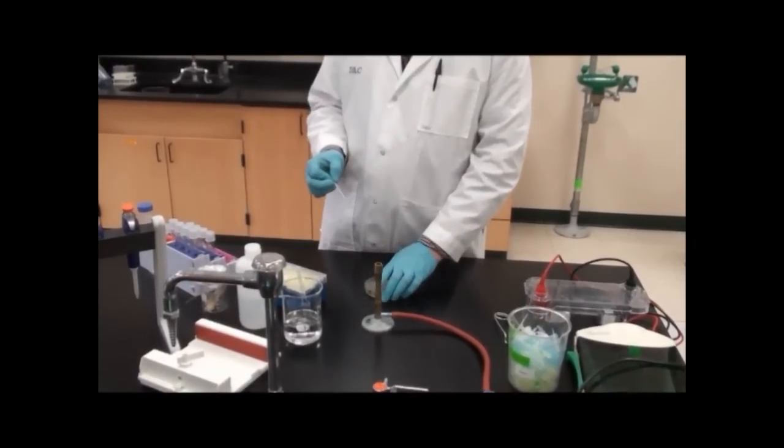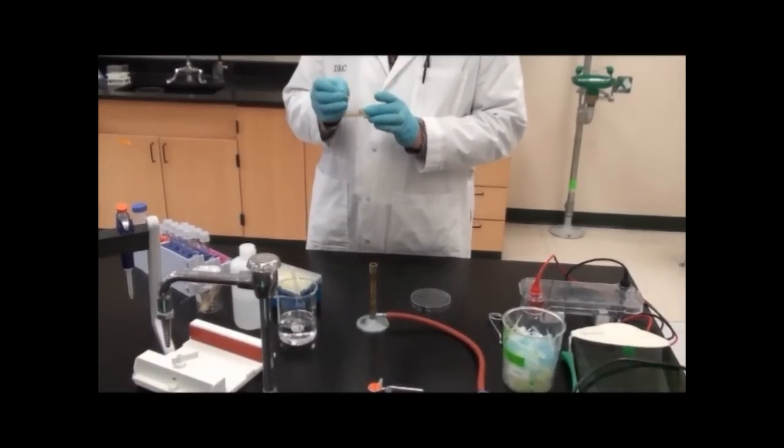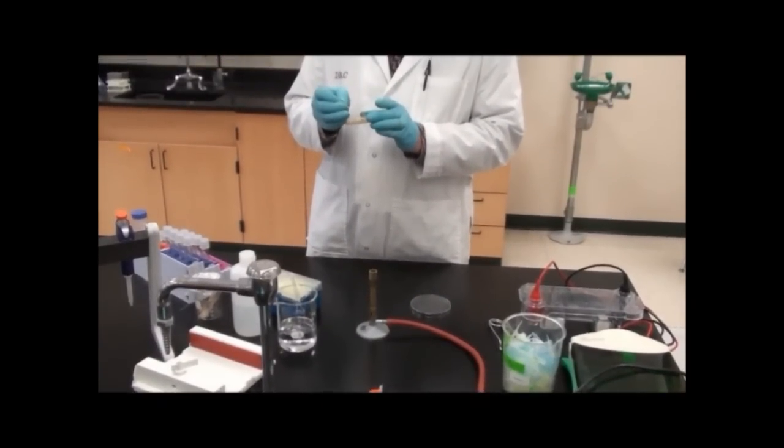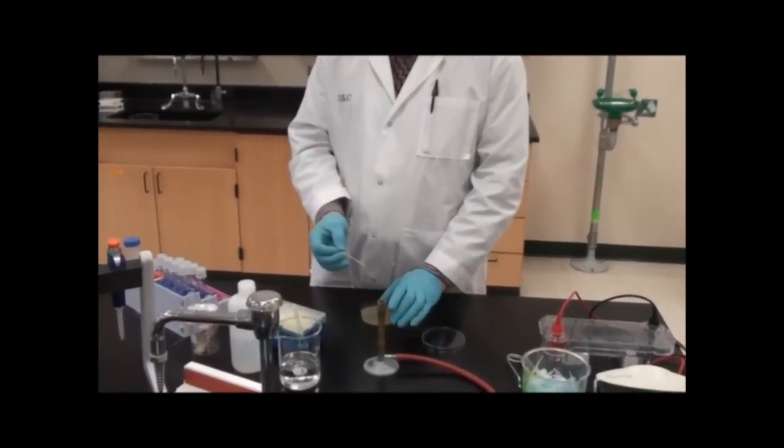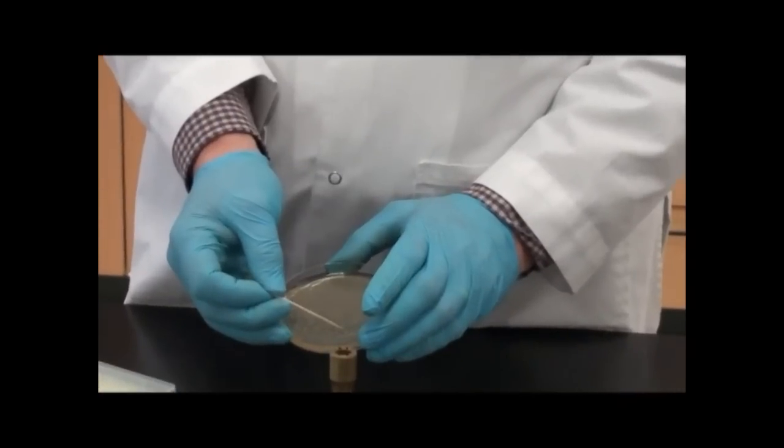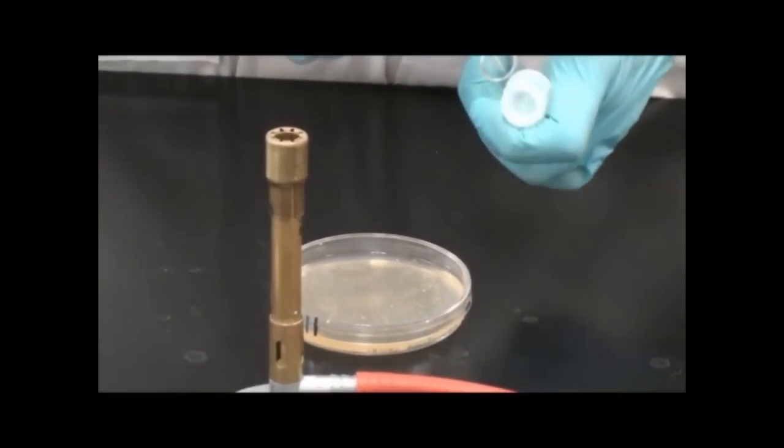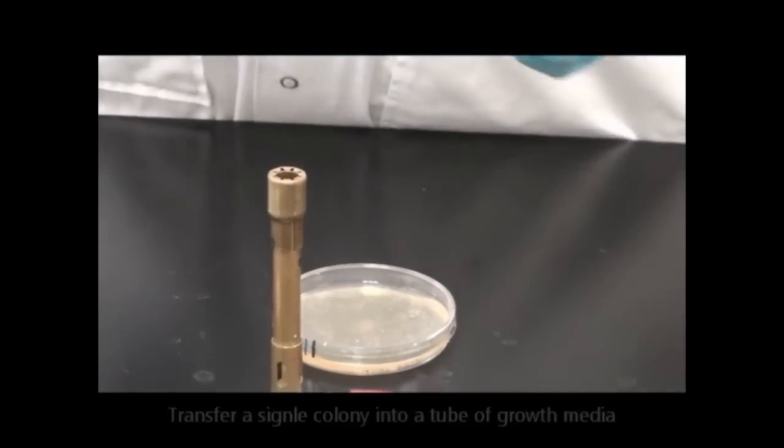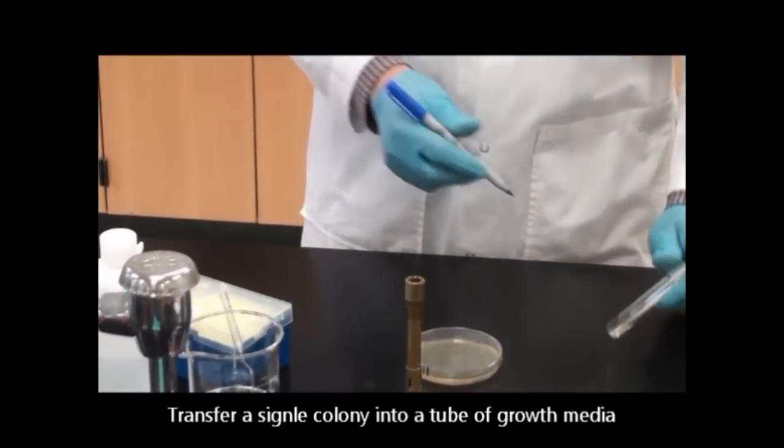I'm going to open up my plate here. I'm going to take this toothpick and just dot a single colony. I don't have to do it hard. I'm just going to dot a single colony like that. Then I'm going to take the toothpick, drop it into my tube that contains my growth media, and I'll label this.